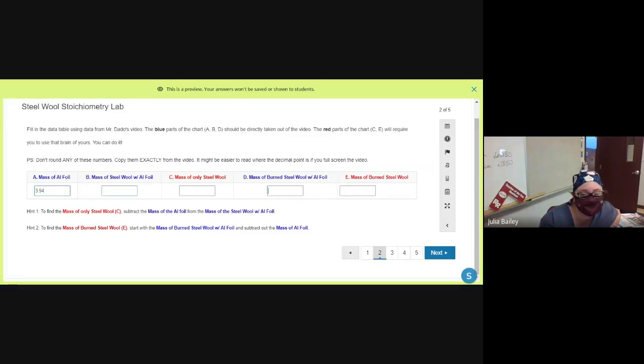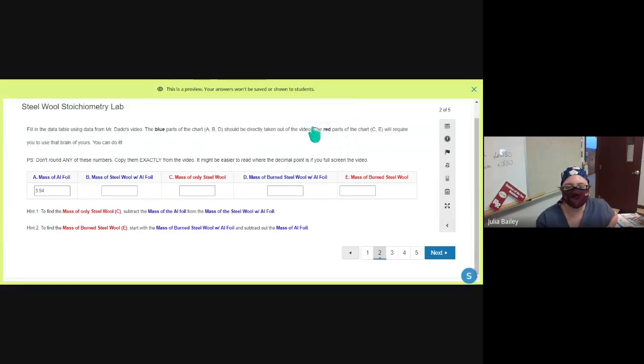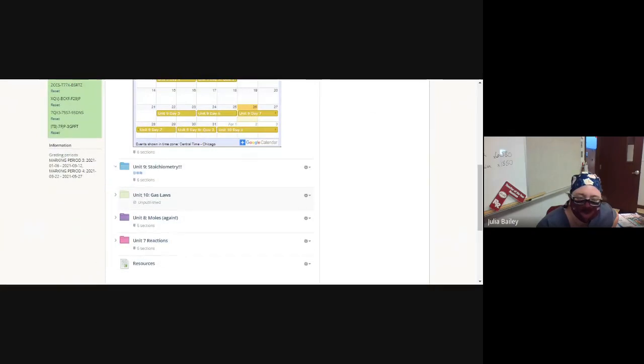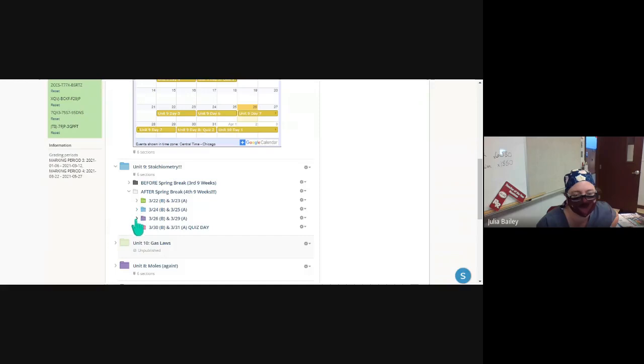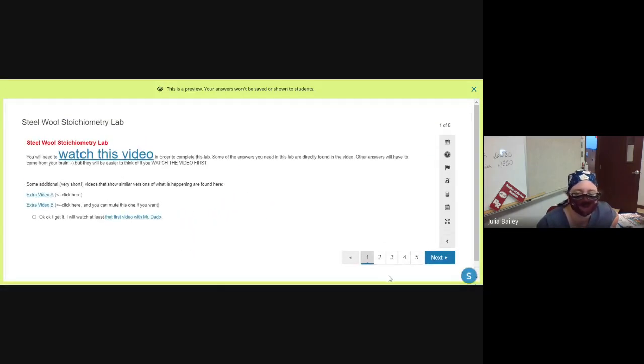The rest of this data table, some of the numbers, the ones that are labeled in blue, this B and D, those numbers are straight out of the video. It even says that right here. The blue parts of the chart should be taken directly out of the video. The red parts of the chart will require you, oh, I just accidentally went backwards. It's okay. They will require you to use that brain of yours. There are hints under the data table that tell you to subtract some stuff. And that's going to be how you get the rest of those answers.